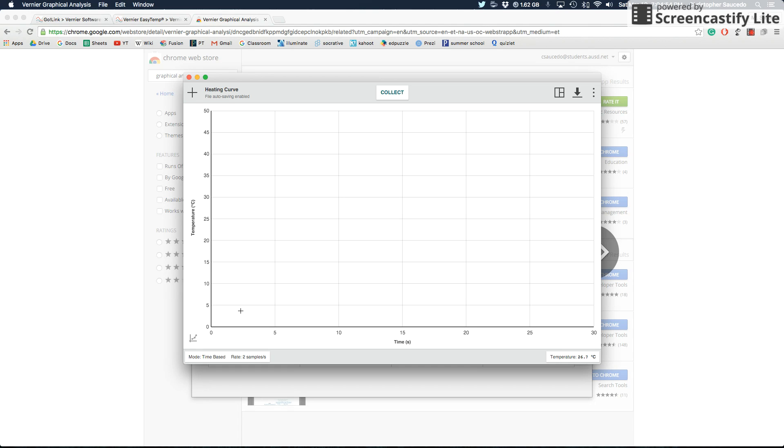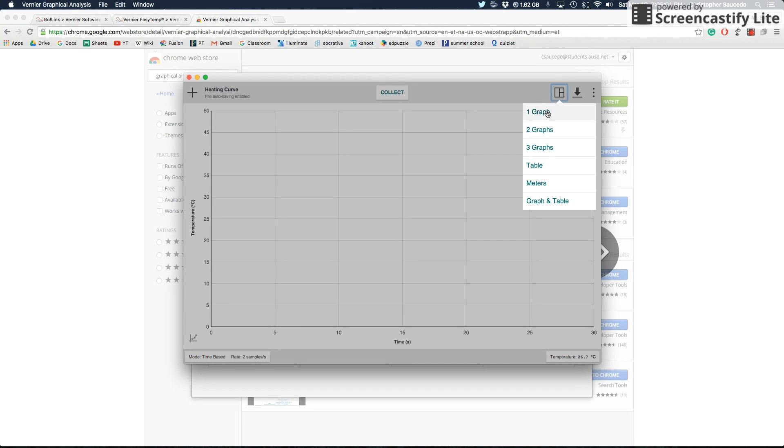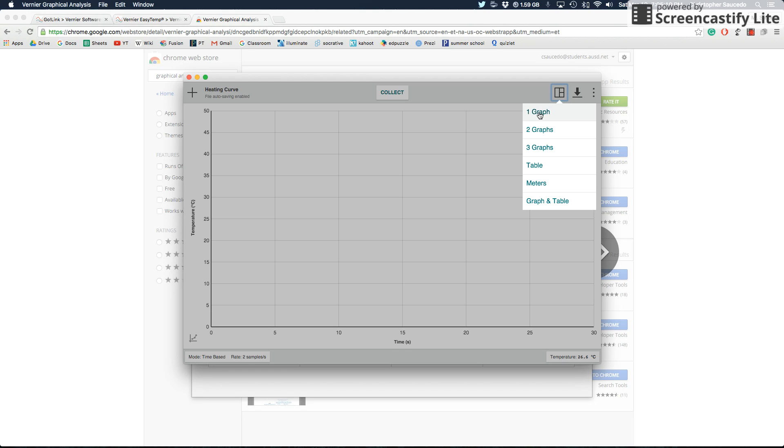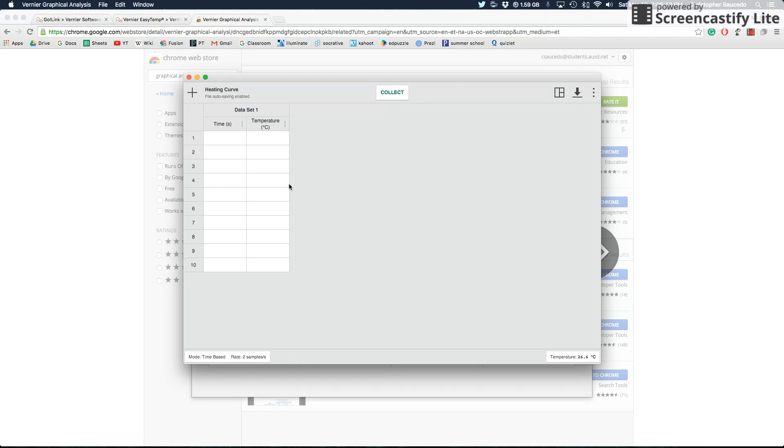Then we can start to use the settings up here where it says view. Now view, one graph, two graph, three graph. In this case, one graph is the only one that really makes sense. We're just measuring temperature, not measuring multiple things. If you click on table, it'll give you the time and temperature. Every half second, it'll take a sample and give you the time and the temperature.